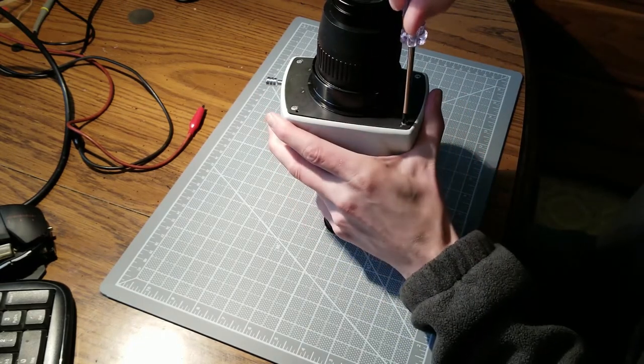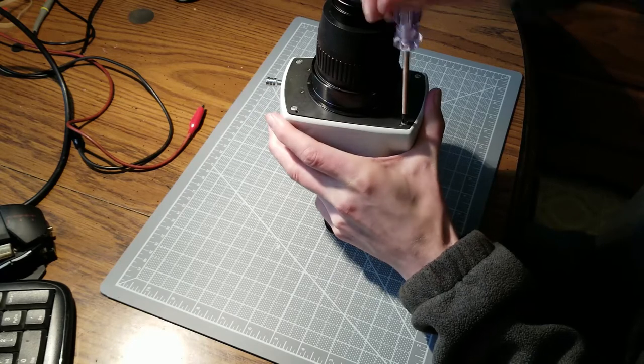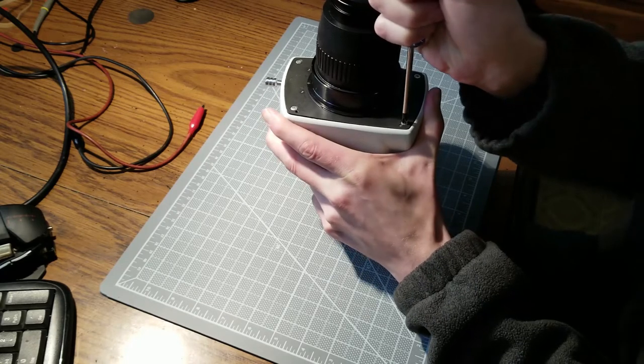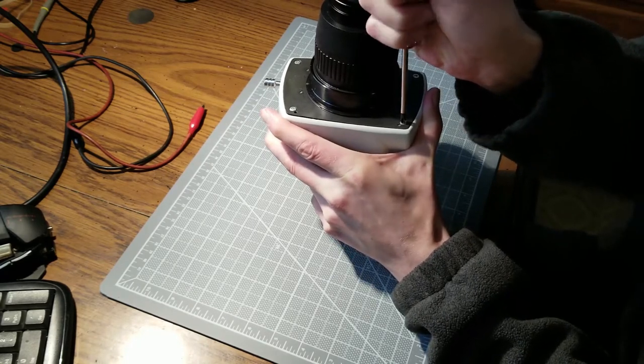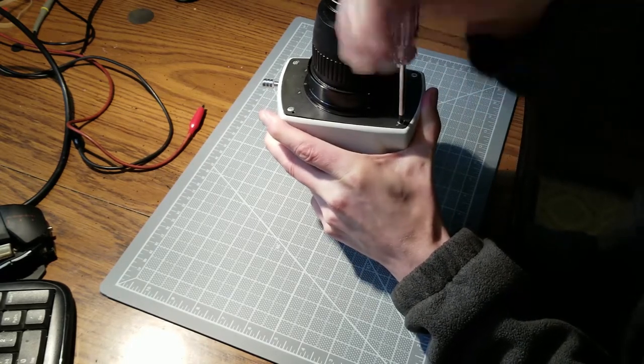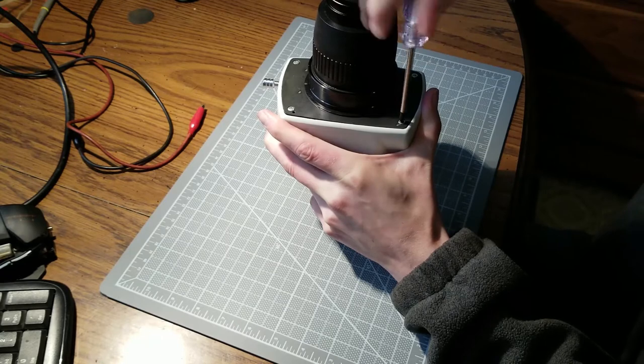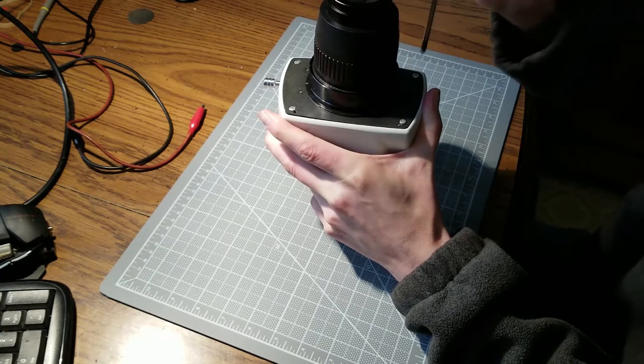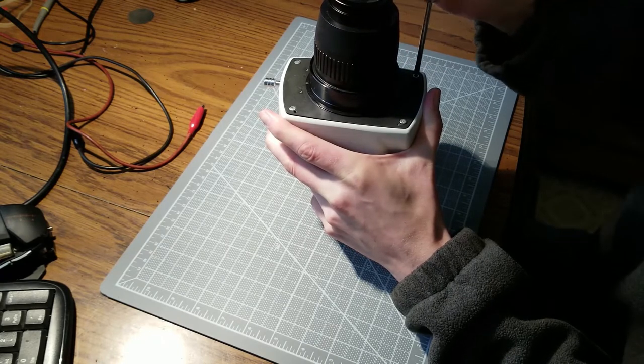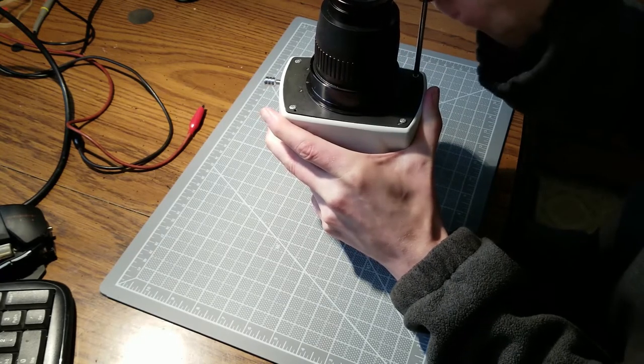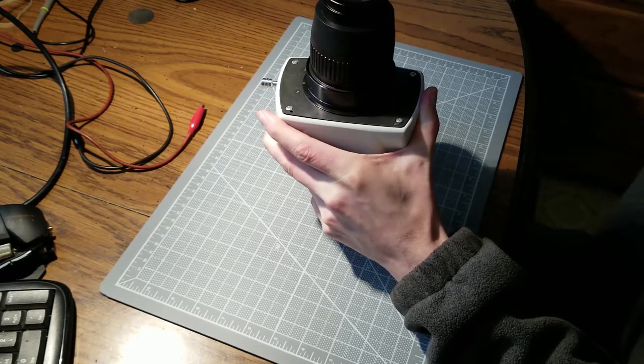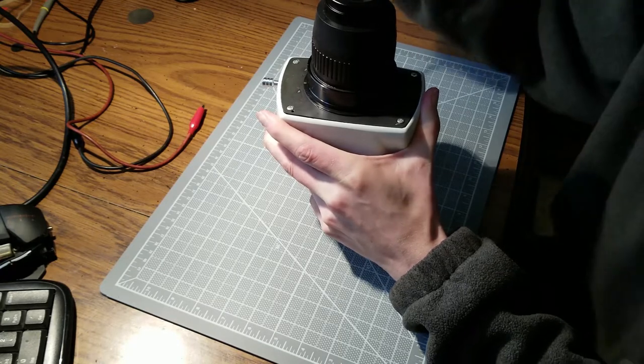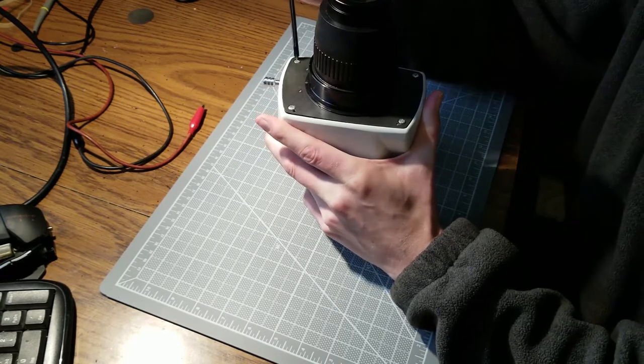So what I'm going to do is just remove these four screws on the bottom. They're pretty tough to remove actually. They're torqued on pretty good, so you want to be careful you don't strip them, put a lot of downward force on them.